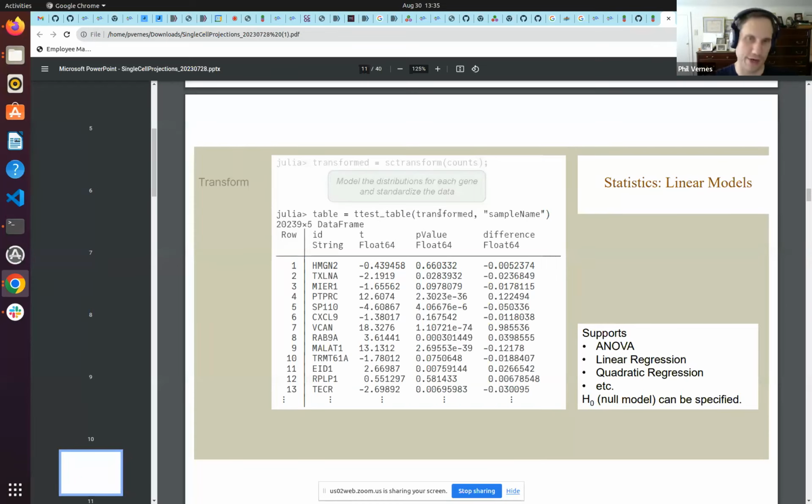So you don't have to worry about breaking it out into samples. It will automatically look for the sample name, P1, P2, and do the t-test correctly. For a t-test, and any of these hypothesis-related questions, you'd want, unless you're doing an f-test, one versus all. But if you do a t-test, you obviously want just 2 samples in your data matrix.